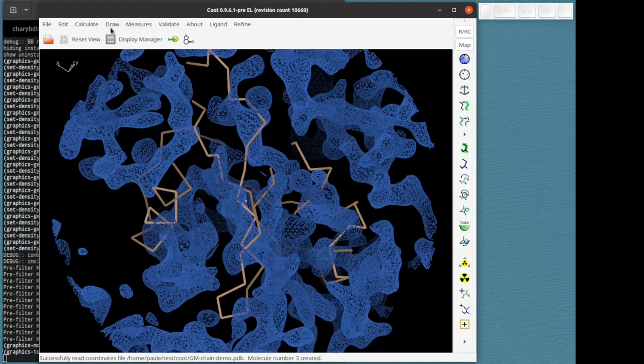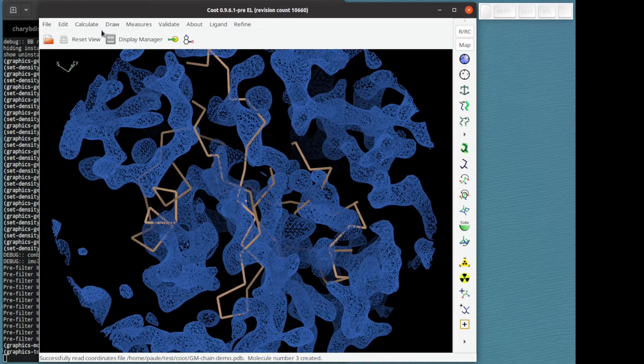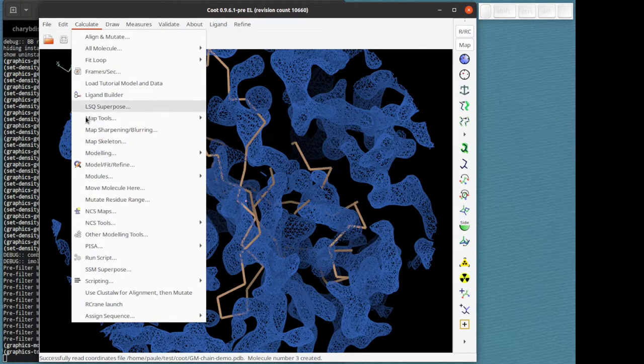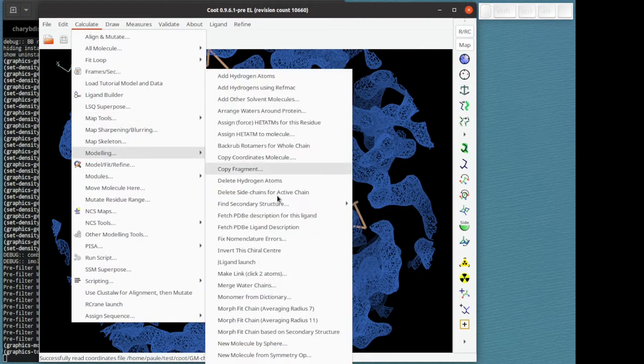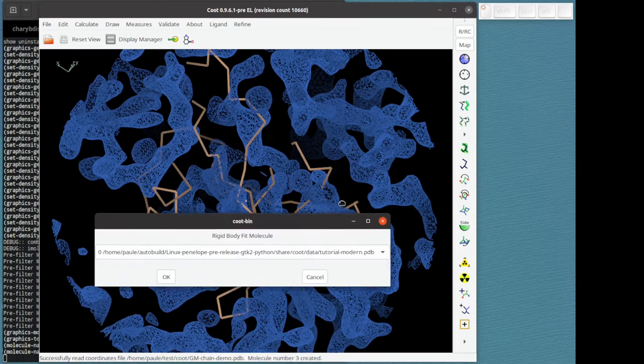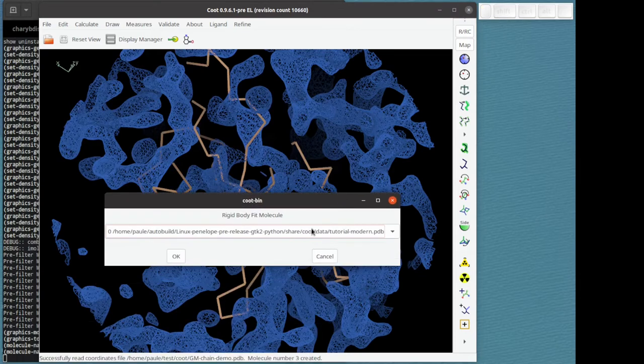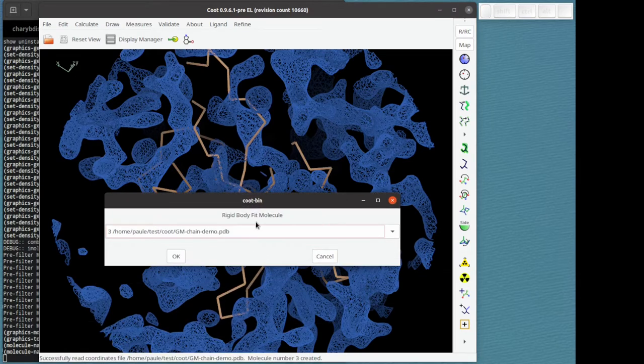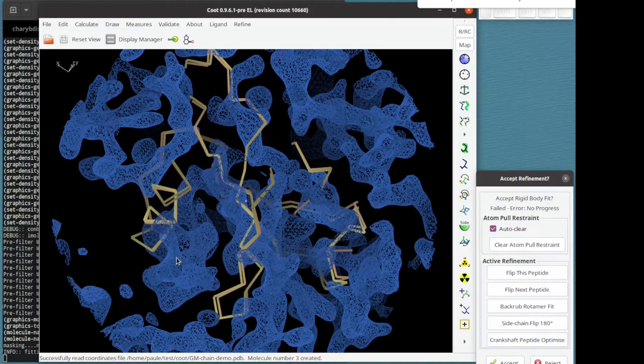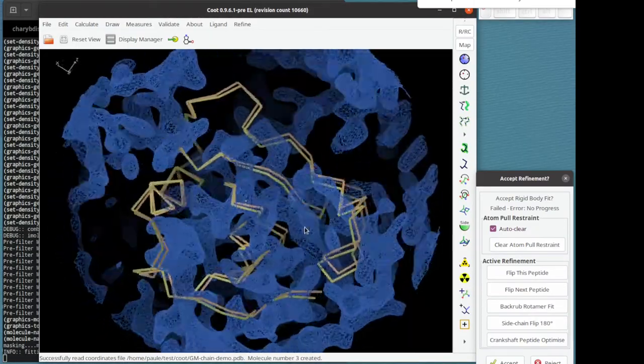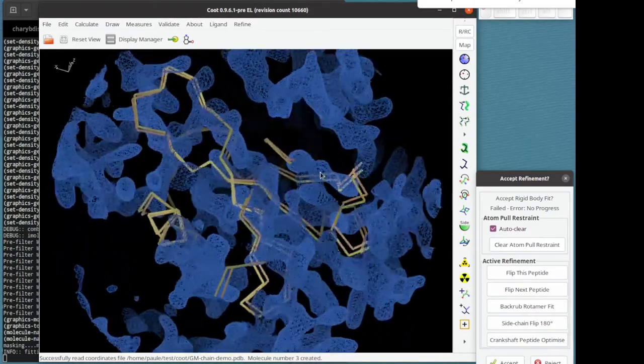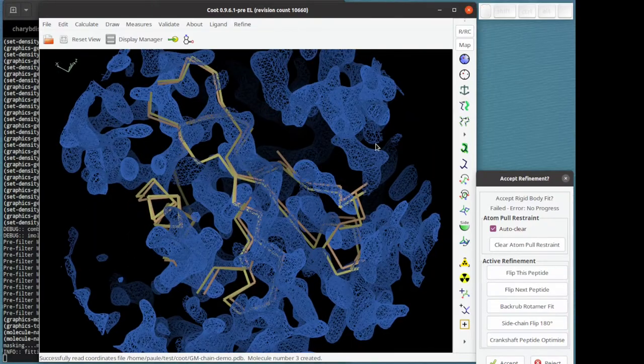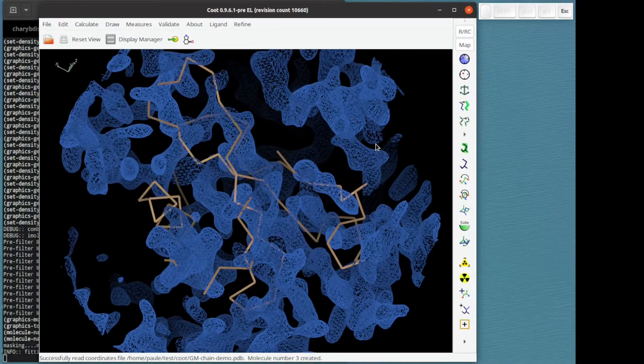If I were to try to fit this with rigid body, let's see what happens. So calculate modeling rigid body fit molecule install and I'm going to choose this demonstration file here and say OK, and you can see it doesn't move very much. The rigid body refinement doesn't get the right solution.